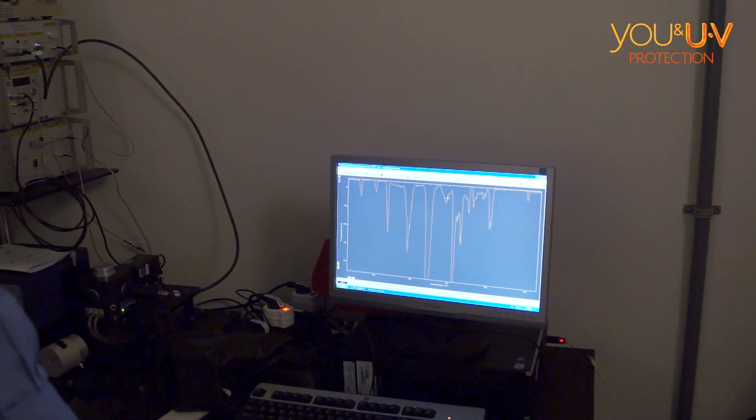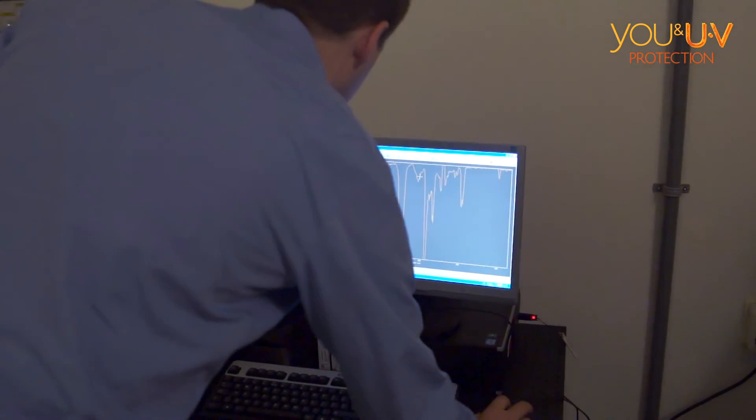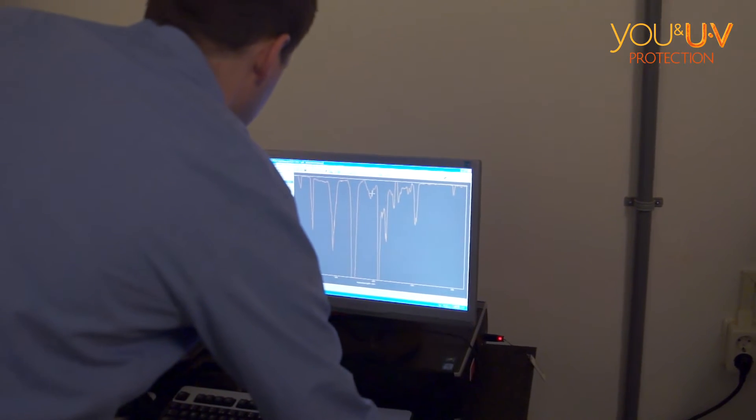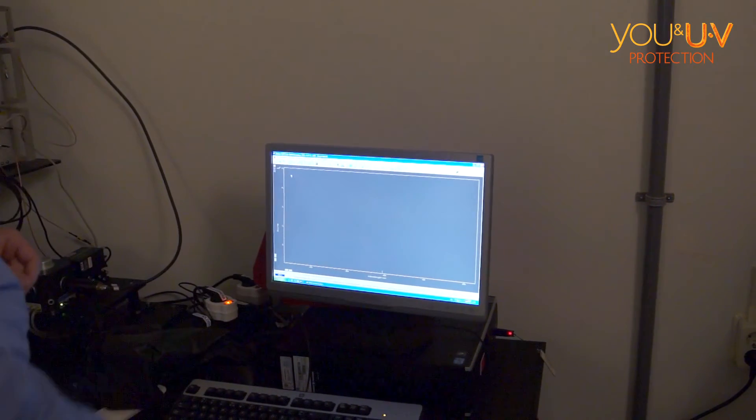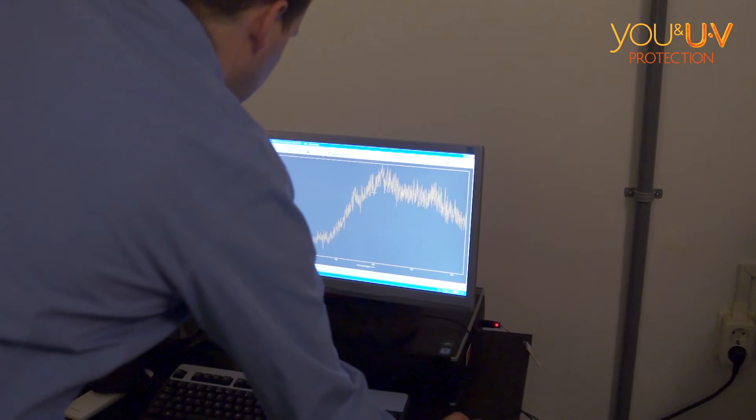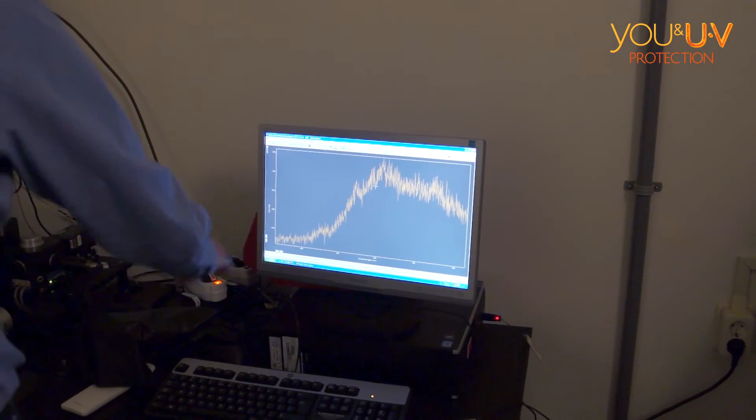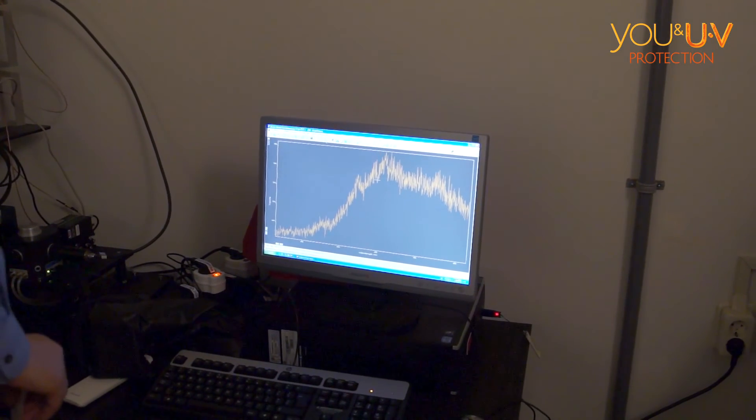I know the camera is not so sensitive to bright lights, but this is much more effective if I turn off those lights. I just shutter the lamp, take my background signal, which is nearly nothing. A little bit of those lights, which are quite broad, nothing in here.